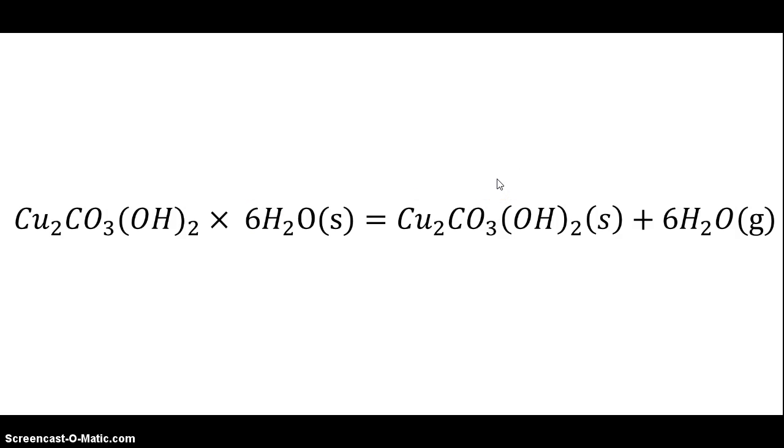Therefore, the balanced chemical equation reads: 1 mole of hydrated copper carbonate hydroxide hydrate bonded with 6 moles of water, when heated, reacts to become 1 mole of anhydrous copper carbonate hydroxide, which is a solid, and 6 moles of water in a gaseous state.